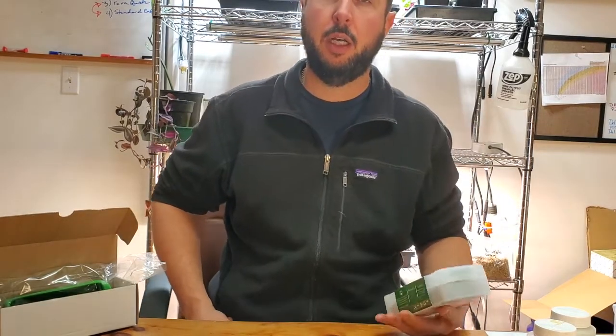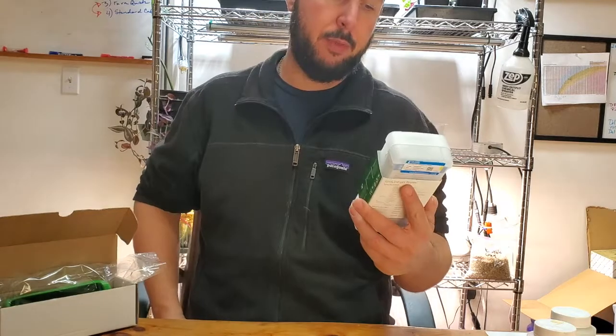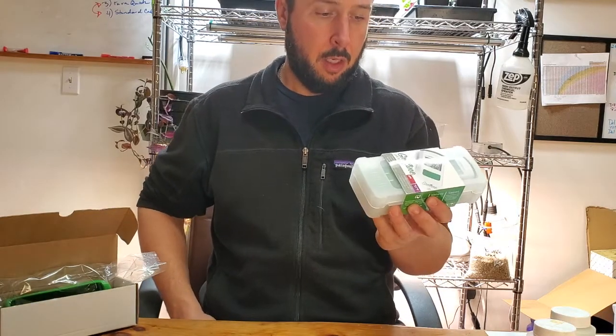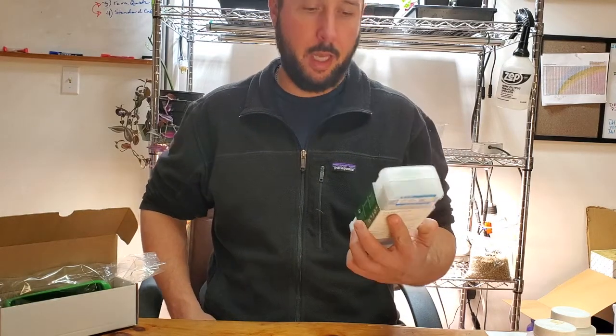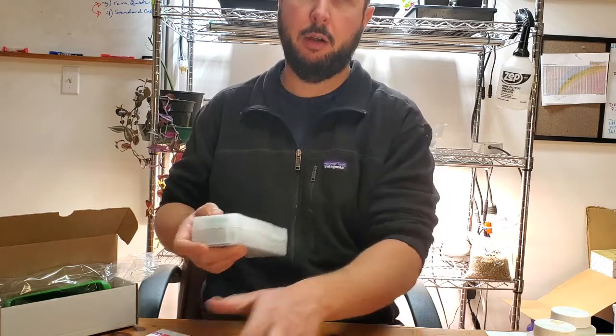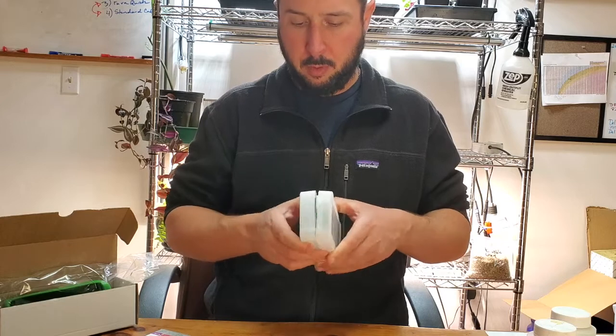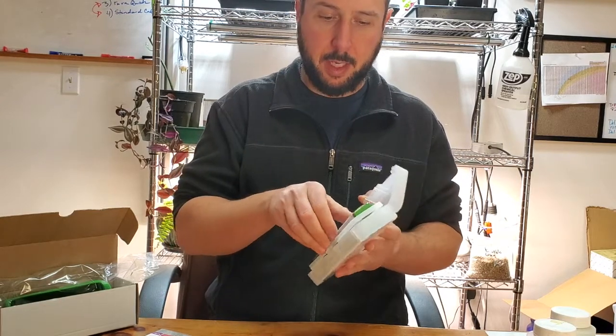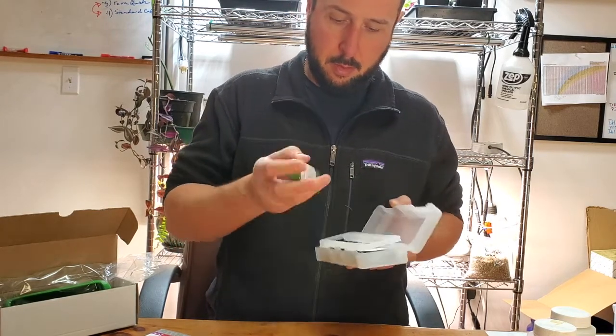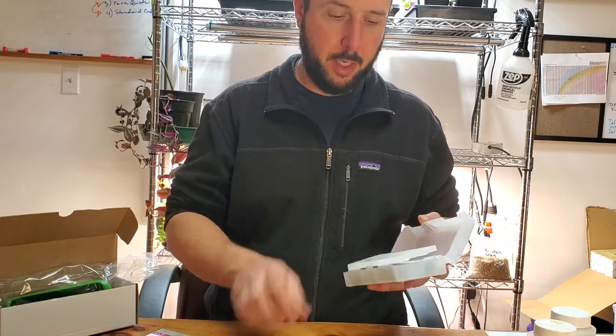Hey there folks, this is Brian Ganey with Sustainable Terrains doing a quick rundown of the Hanna Grow Line 9811-8, which is basically just their pH pen. Brand new, comes in the box like so, nice little durable meter.